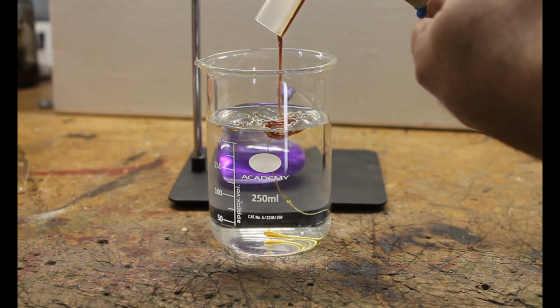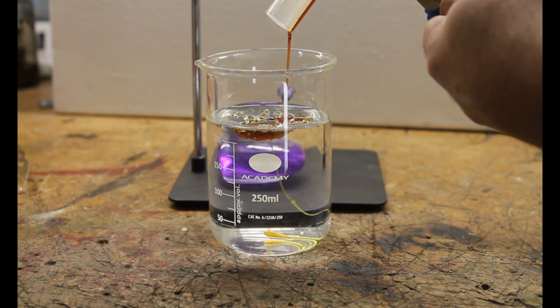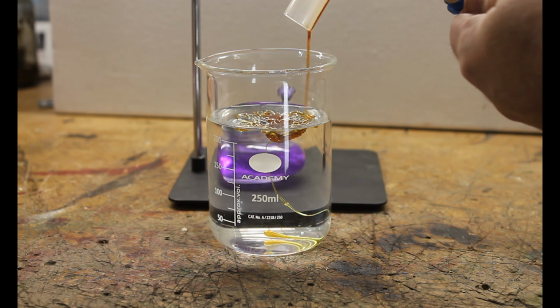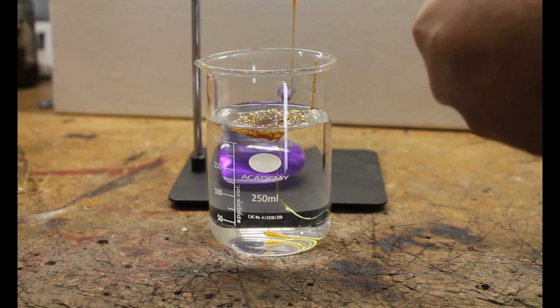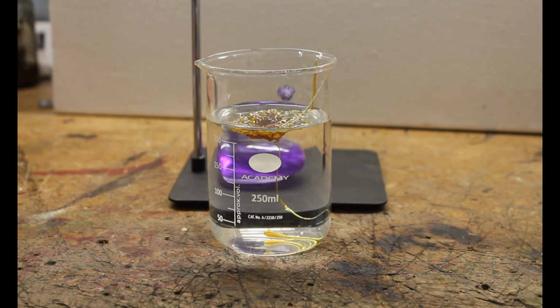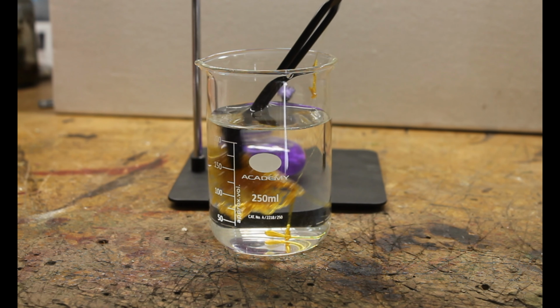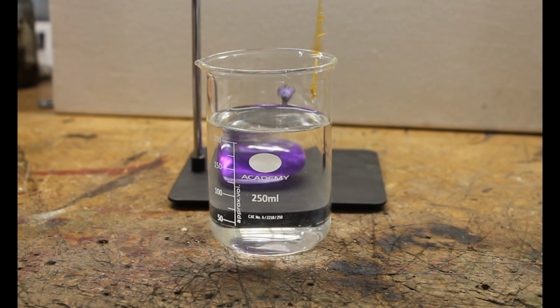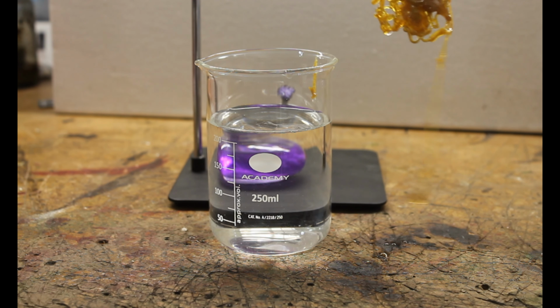But of course, this being so dense, it does take a while to pour, so we have once again sped up the footage. Let's remove our sulphur polymer from the beaker of water and have a better look at it. We're going to place it onto some filter paper to see some of the new properties it's undertaken.